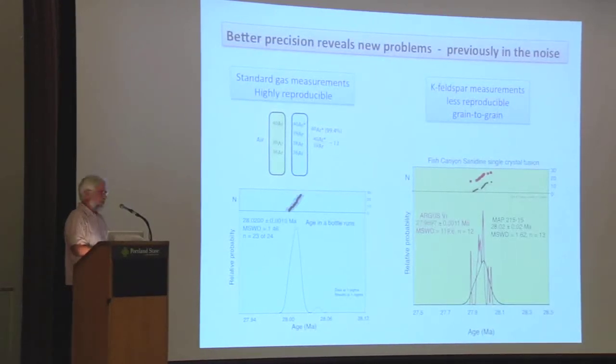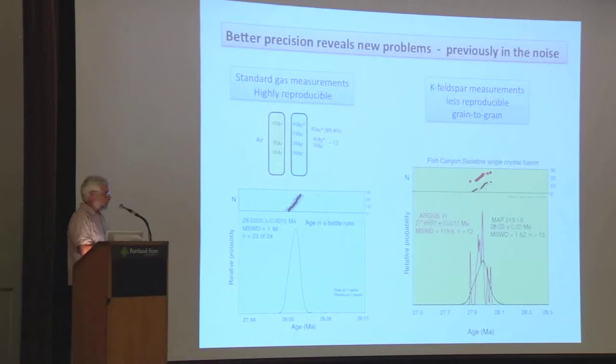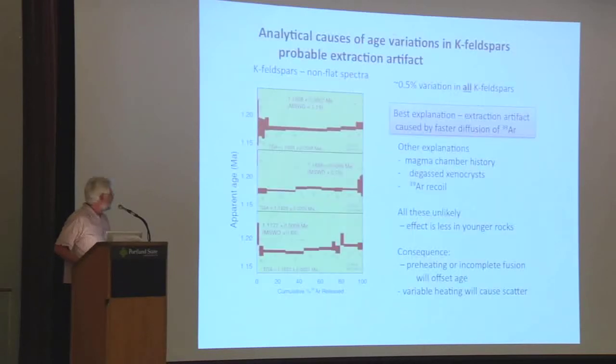Well, much of this turned out to be related to an irradiation artifact, which was that we irradiate the samples in small aluminum discs with wells on the order of 2 to 6 millimeters in diameter. And once we were able to use the new machines to map that flux distribution, we found that there was much more variation in flux across those irradiation pits than we had formerly thought. That problem was relatively easily solved by going to smaller irradiation pits, typically 1 millimeter, which reduced the spread in flux to something similar to our analytical error.